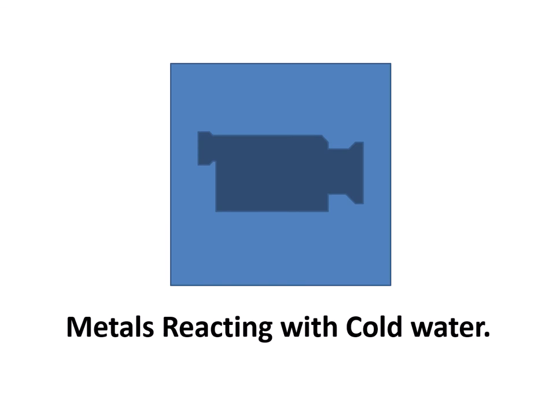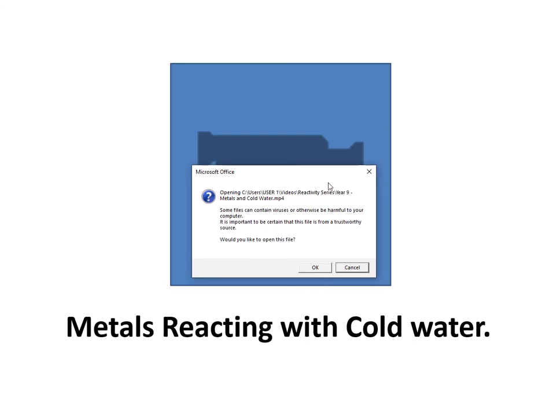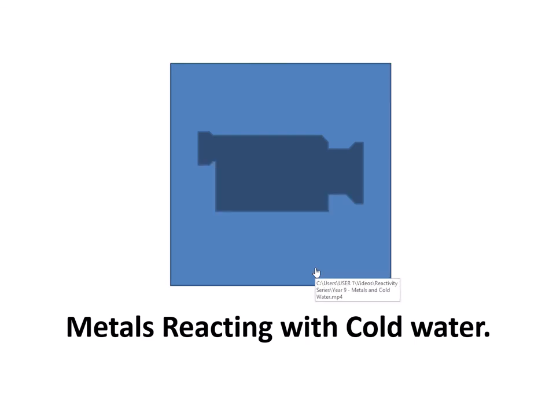Now I'm going to show the reactions of several metals with cold water, videoed in our lab. Watch the metals being dropped into cold water and write down your observations on the worksheet. You can either listen and pause to write, or watch all the reactions first and then fill in observations at the end.